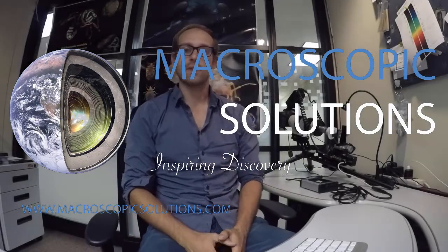Hi, this is Mark with Macroscopic Solutions. Today I'm going to be using the 50x objective with the Macropod Pro 3D and micro kit.